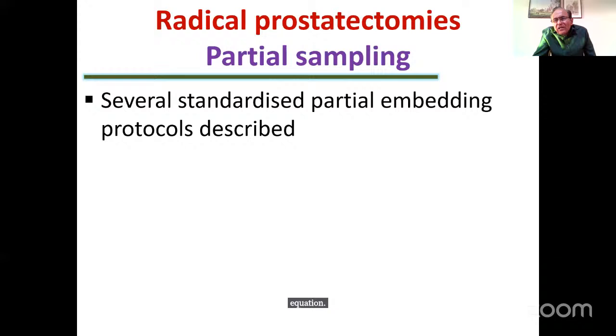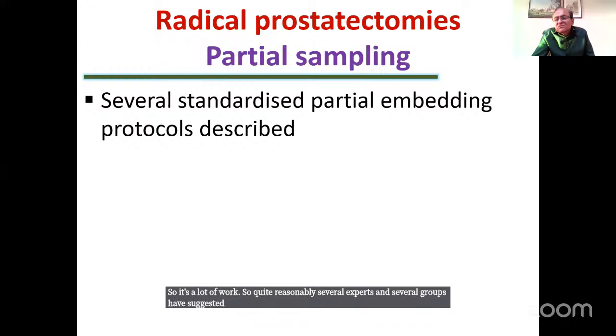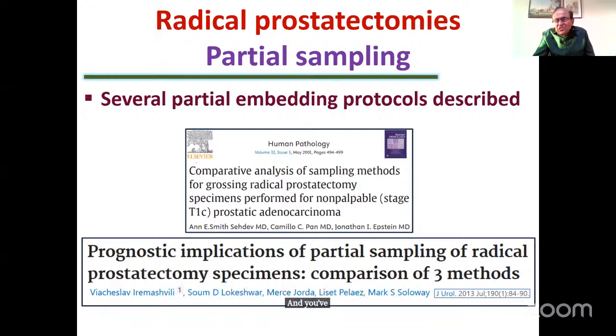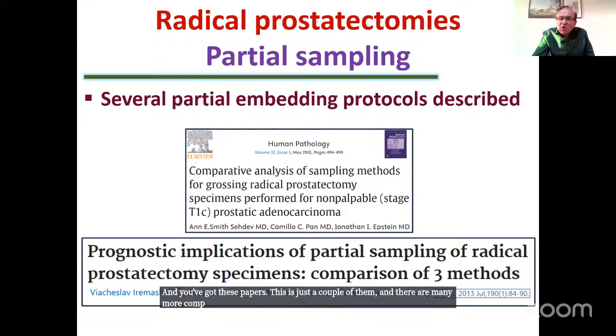So it's a lot of work. So quite reasonably, several experts and several groups have suggested partial embedding of these prostates, right? So that you save blocks, save time, save money. And you've got these papers. This is just a couple of them, and there are many more comparing the various ways of partially embedding prostates.